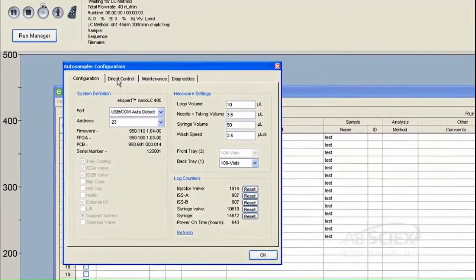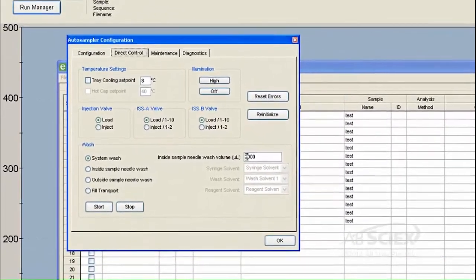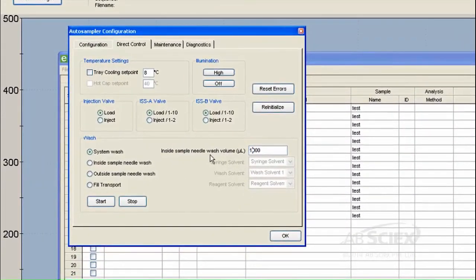In the Autosampler Configuration window, click the Direct Control tab and select the System Wash radio button in the Wash group of the Autosampler Configuration window.